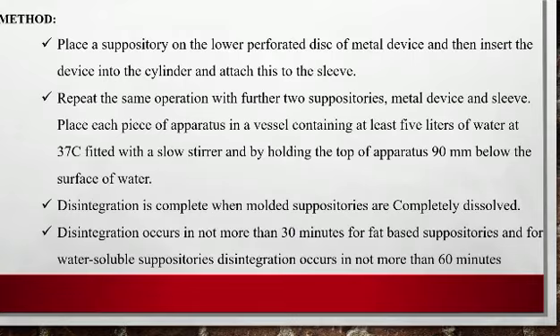Disintegration test is nothing but checking how much time it takes for the suppository to get completely dissolved in the body fluids. We take the suppository in a lower perforated disc, and above it we place another disc, which helps keep the suppository from moving.